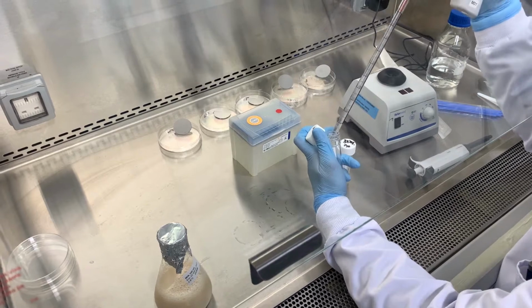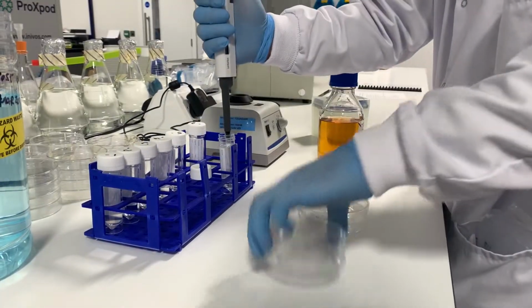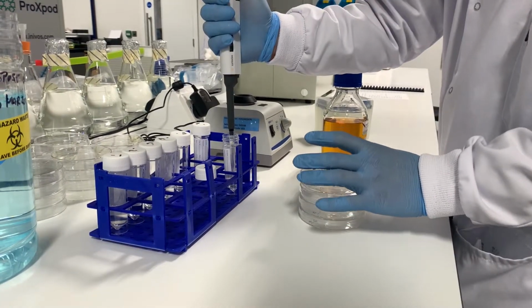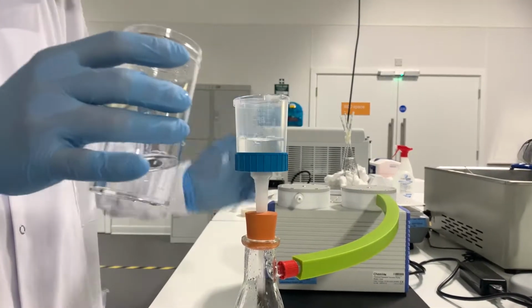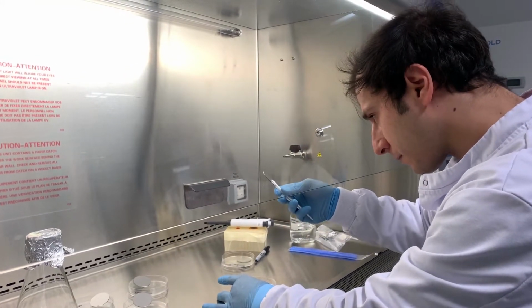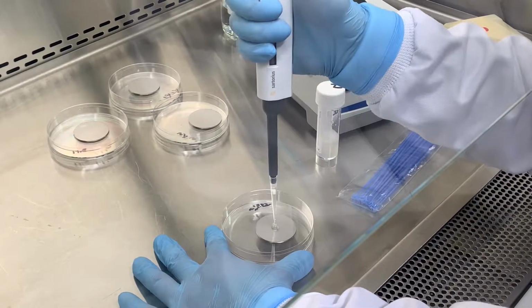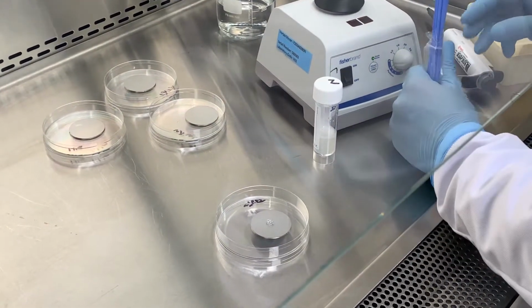The inoculum suspension concentration is confirmed by performing 10-fold serial dilutions down to the estimated concentration. The final dilutions are plated out by performing a 1 ml pour plate alongside a membrane filtration count. Once the carriers have completely dried, we are ready to inoculate them with 50 microliters of a final inoculum suspension, which should result in a minimum of 1 × 10⁶ CFU per carrier.